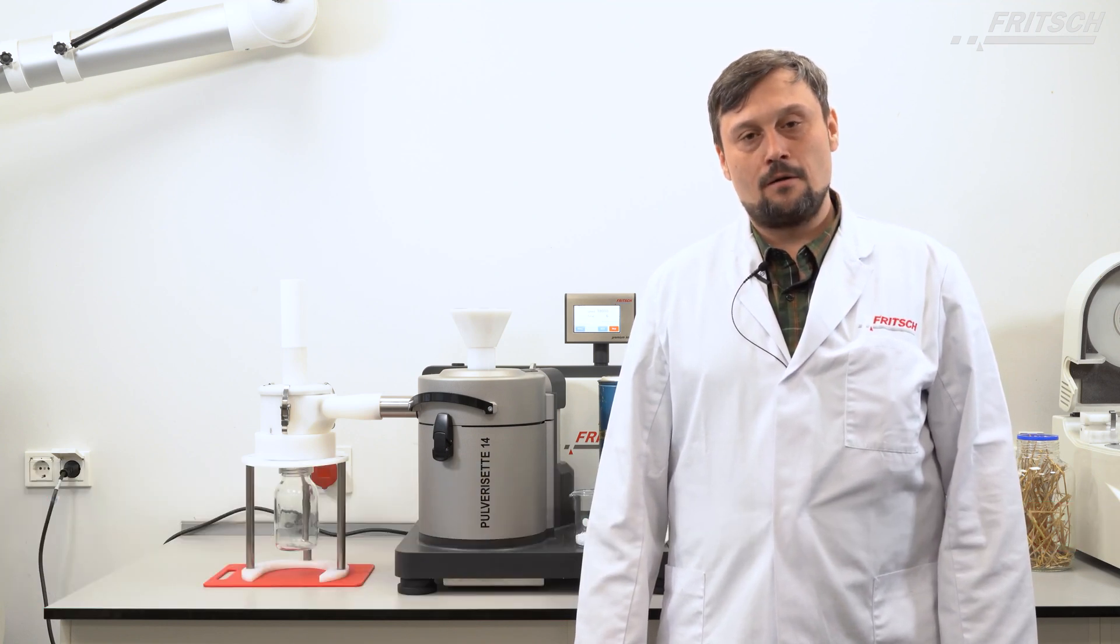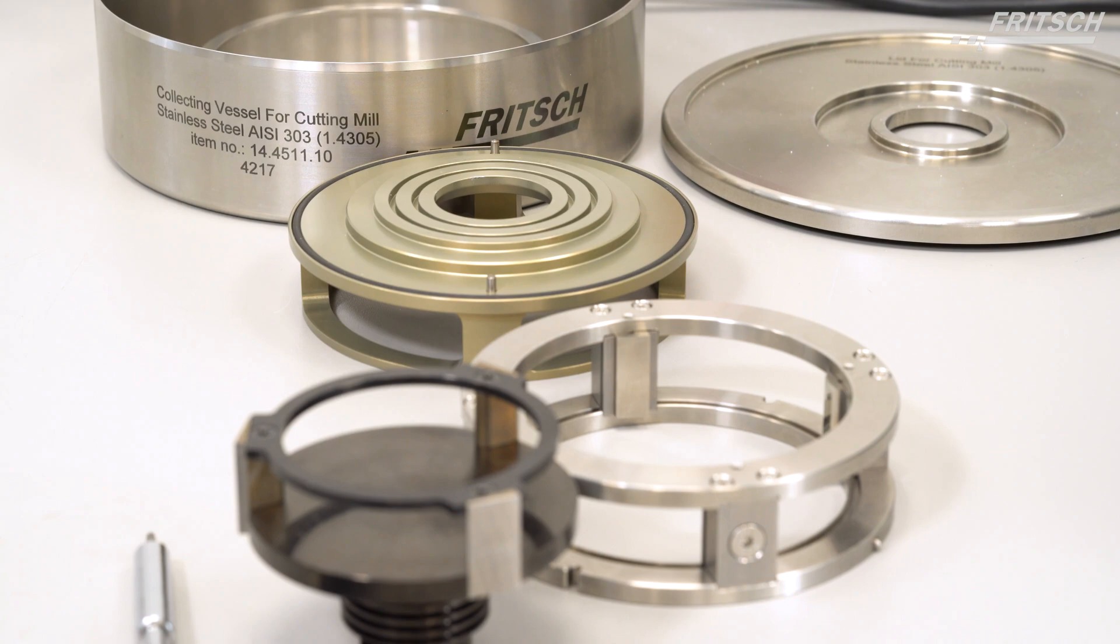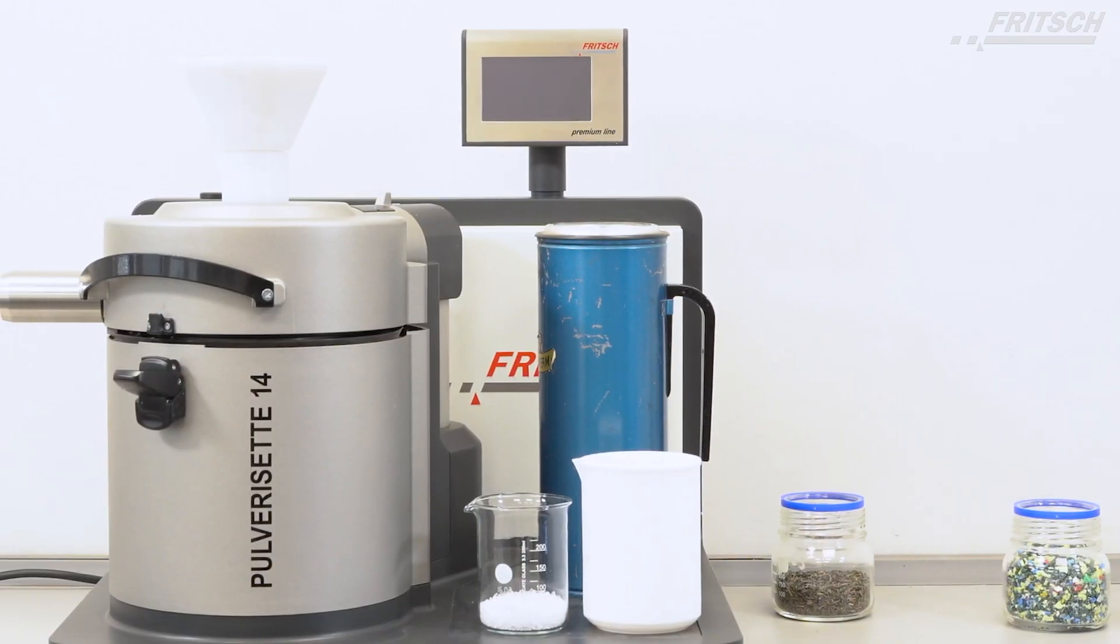Hi, today we want to show you the cryogenic application with our Pulverisette 14 premium line converted to a cutting rotor and the advantages of cryogenic grinding with a cutting mill.